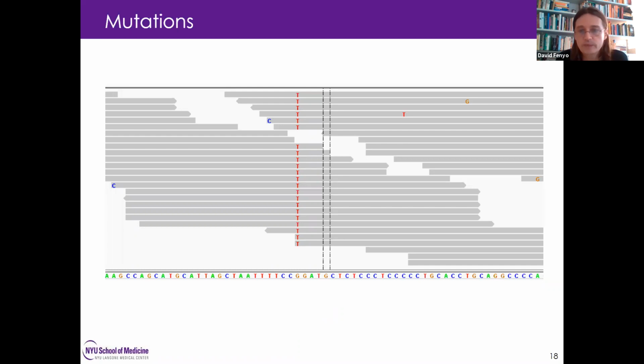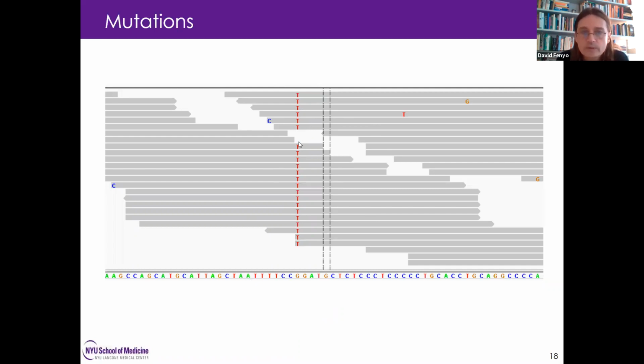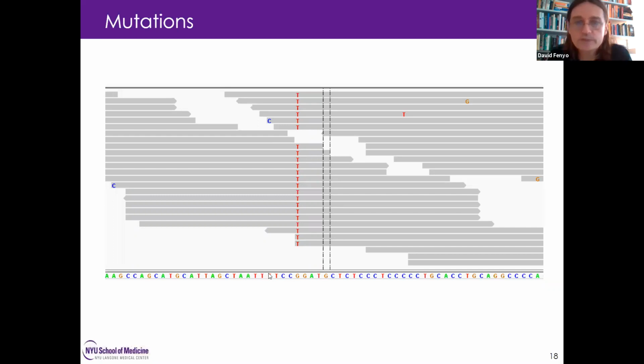We have looked at this quite a bit in cancer, where, if these are somatic mutations, then they could be quite important. But the other thing to observe on this plot is that we have these single reads that are different from the other reads and the reference sequence. So then the question is, is that an error, or is it, for example, that a few percent of the cells in the tumor have this mutation?